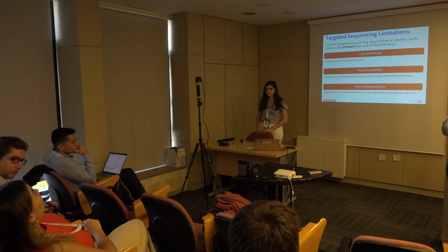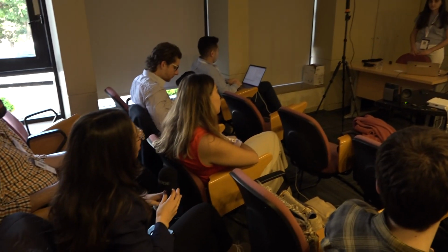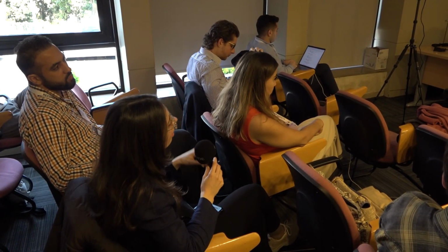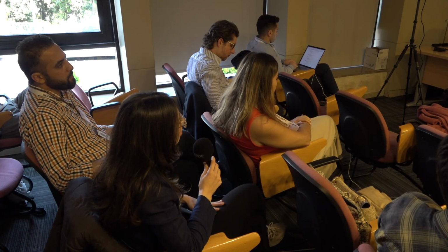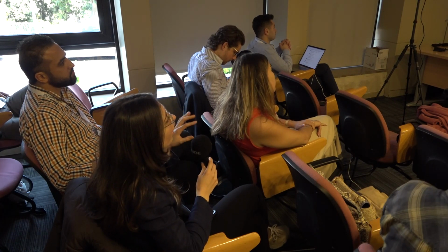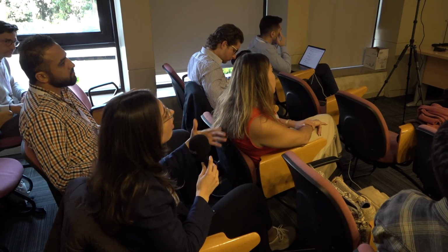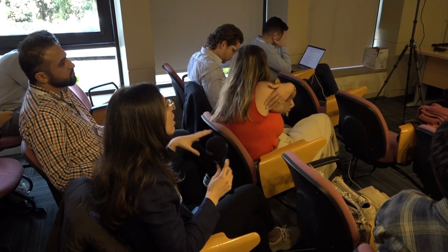So you gave the sepsis example. From my understanding, the reason that the other tools have such low performance for the sepsis case is because you actually require the precision to be higher in that case. Am I right? Exactly. Then again, what makes TargetCall so much better at precision than those tools in all cases?